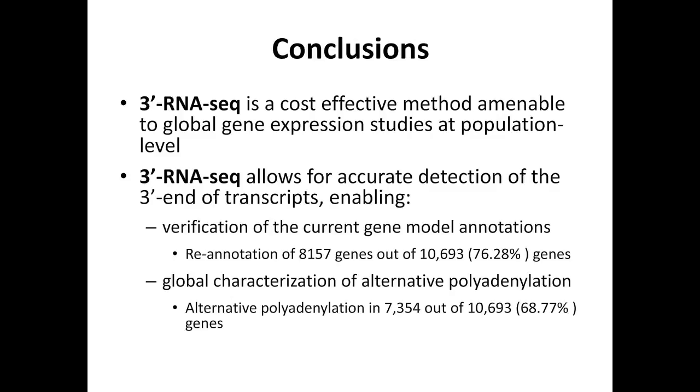People would be interested in looking at the association between variation in polyadenylation and phenotype, because sometimes transcripts with different lengths do different jobs, or have different lifespans. So it would be interesting. People can study this type of polyadenylation using a technology that is not very expensive.